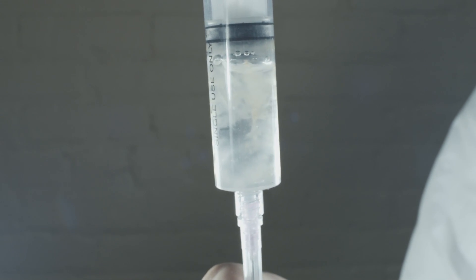Next, the clean plate is transferred into liquid culture. This is just water with dissolved nutrients. The mycelium is left to grow in liquid until it's about this consistency.